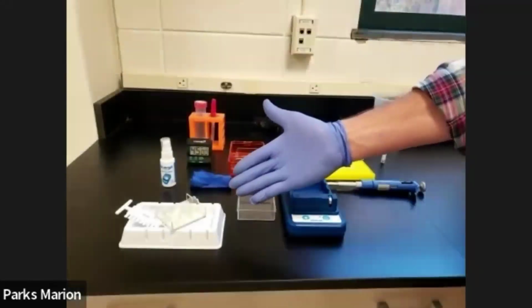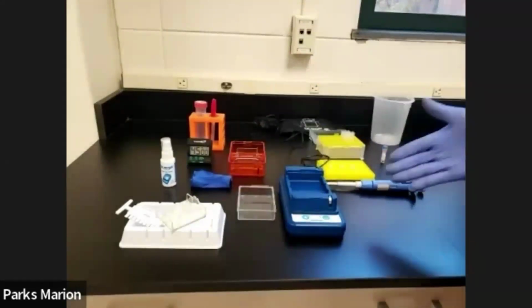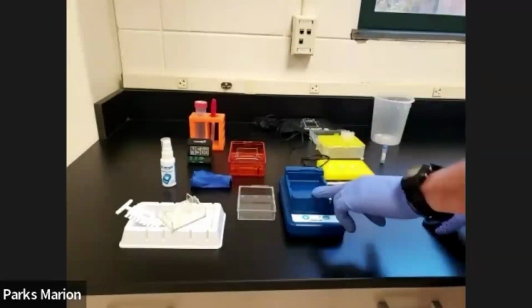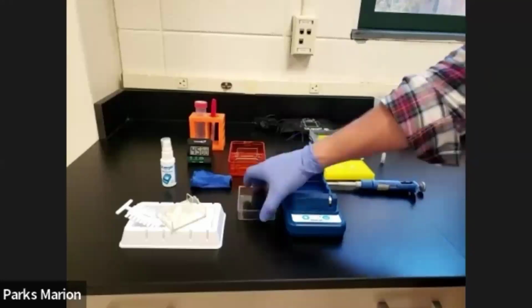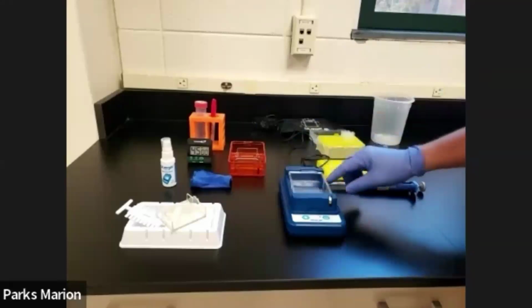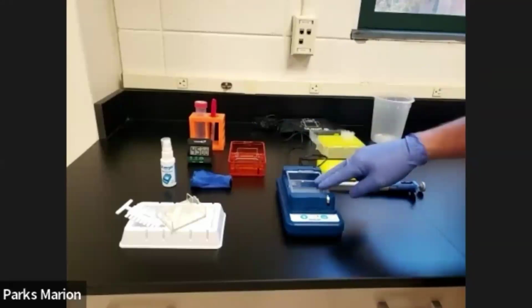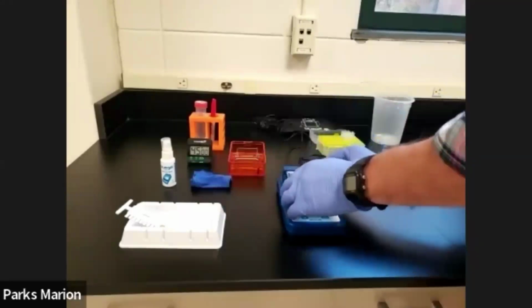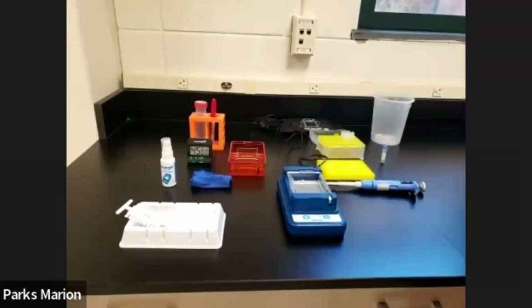Now that the gel has been removed from the casting tray, we're ready to run gel electrophoresis. The electrophoresis chamber is going to be set up in the following way. The base, which should be unplugged, is ready to go. Then we add the buffer chamber into the base, making sure the notches line up in the correct way. Next, we're going to put the gel tray into the buffer chamber, just like this, making sure everything is lined up correctly and you're not forcing anything.